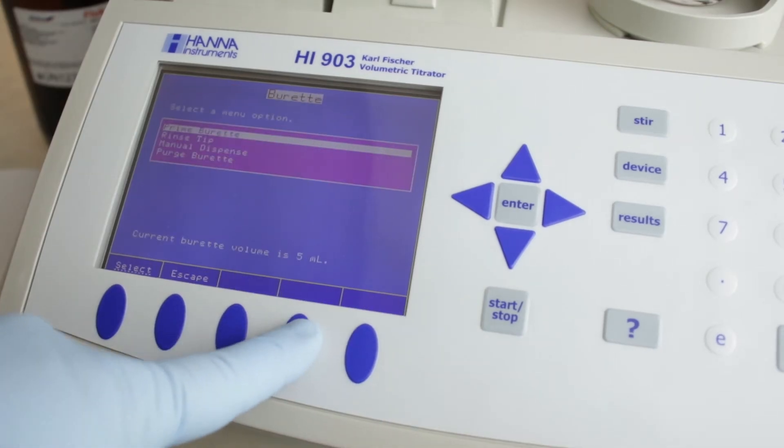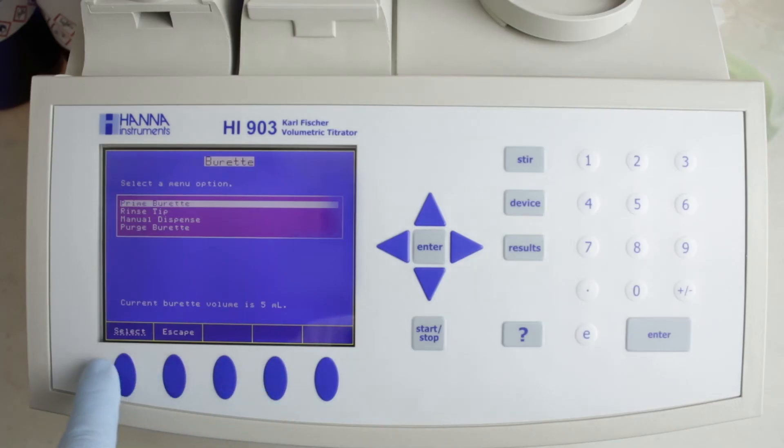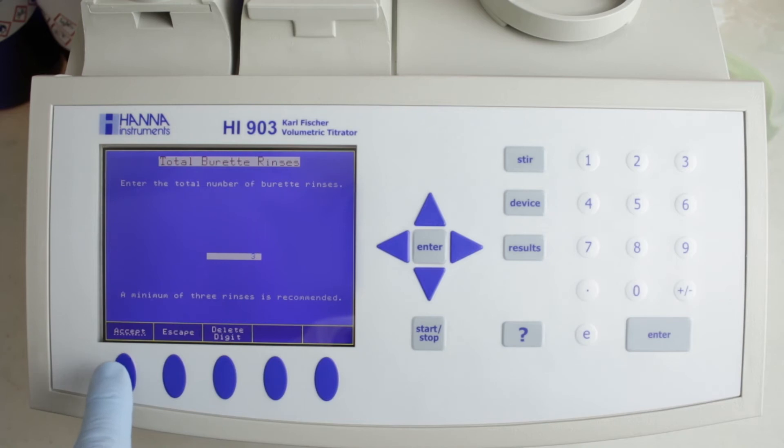Now press the burette button and select prime burette for three rinses to prime and fill the burette and hose lines all the way through the dispensing tip.